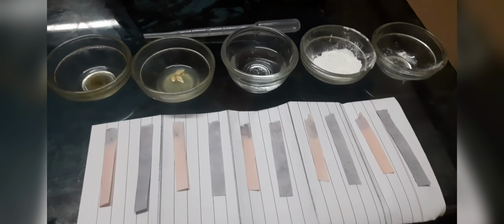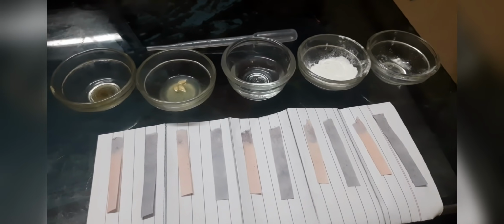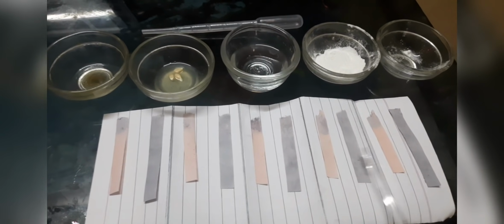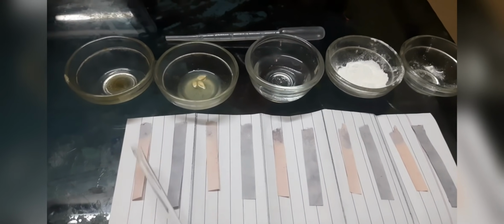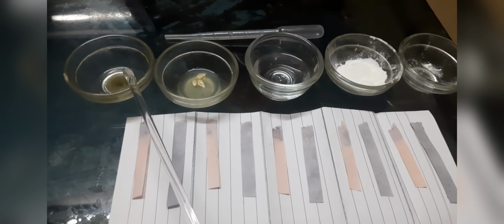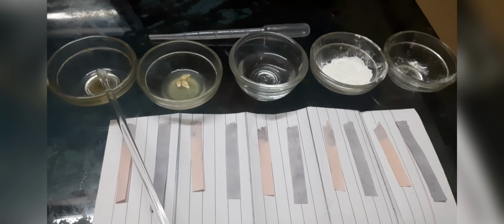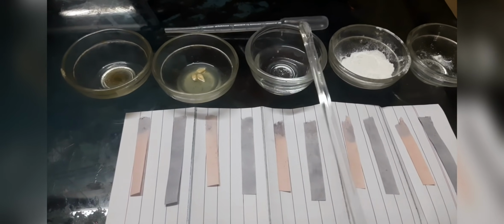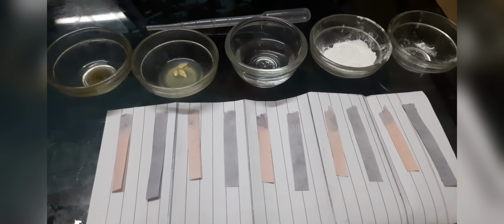And we have some samples. I have stored some samples in this kind of small container. So let's start our experiment. Over here we will take red litmus, blue litmus, red litmus, blue litmus. We will arrange them in this order for each sample. This one is empty, I will tell you what it is. And over here for lemon juice, and so on.